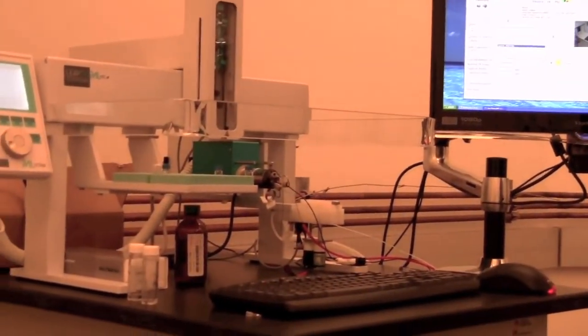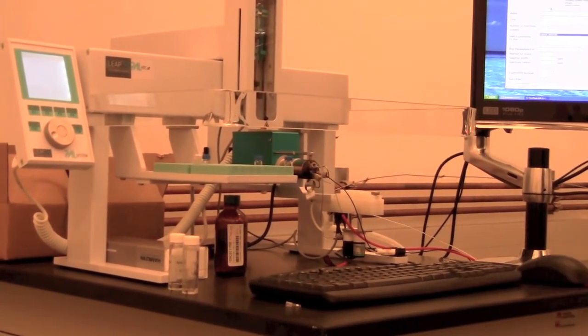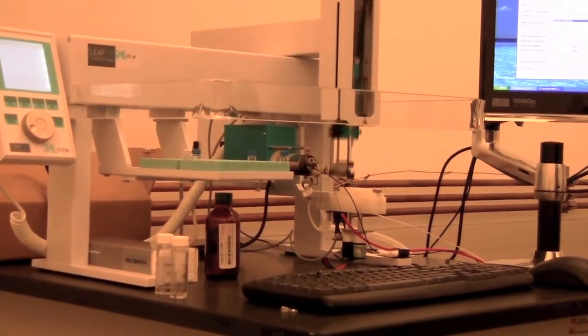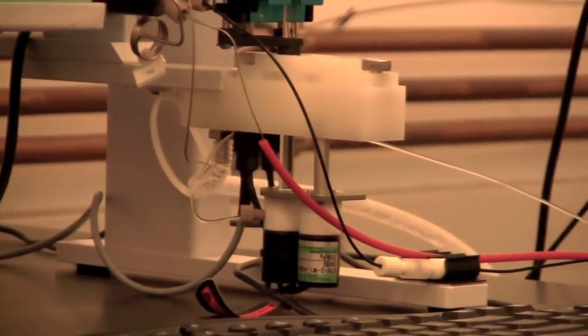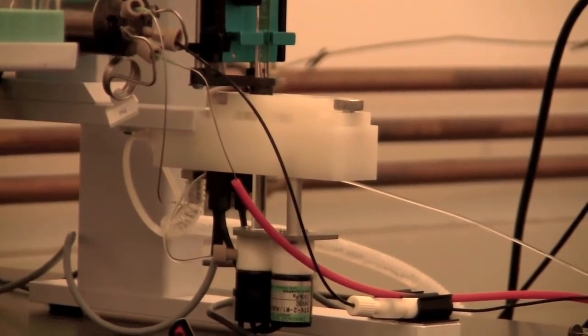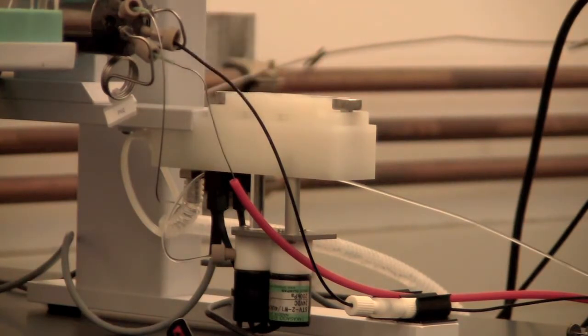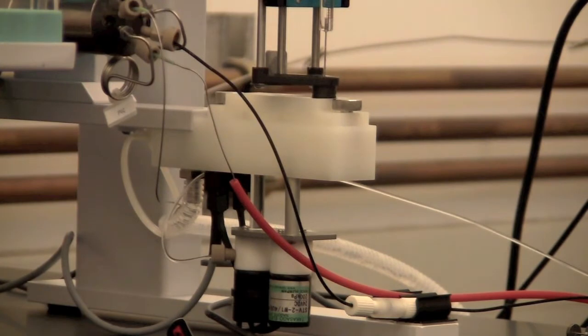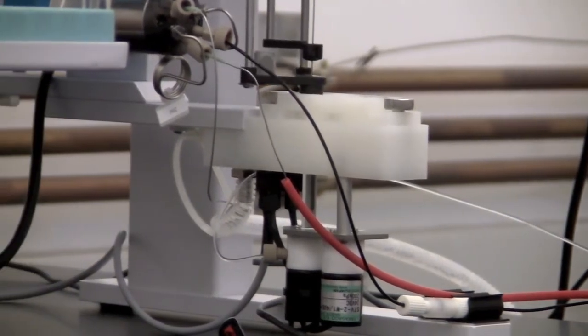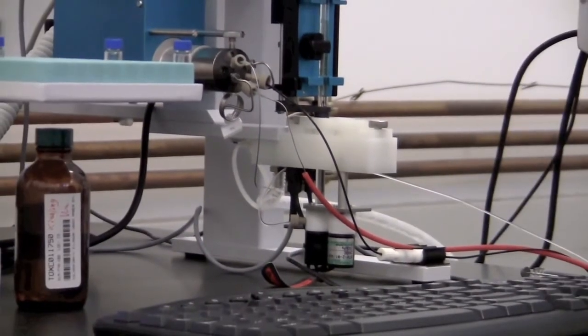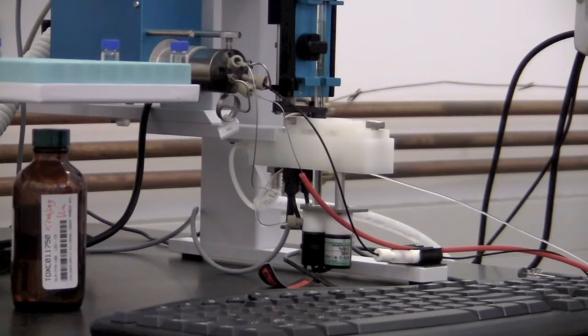Coming over here, first thing it will do is wash the syringe. It washes the syringe by taking the DMSO solvent, loading it into the syringe, and then flushing it into the waste. Then it does the second wash.